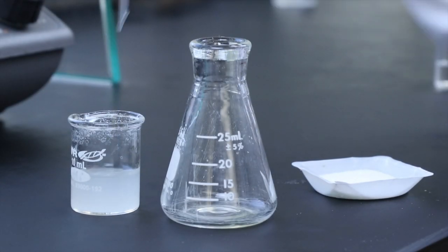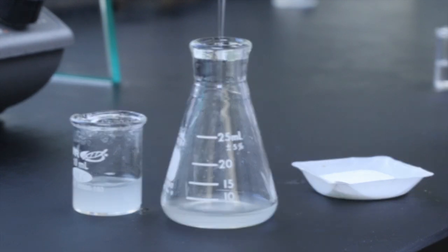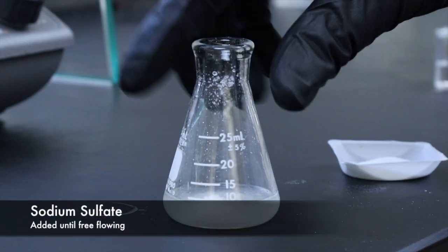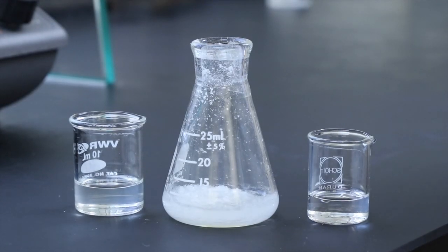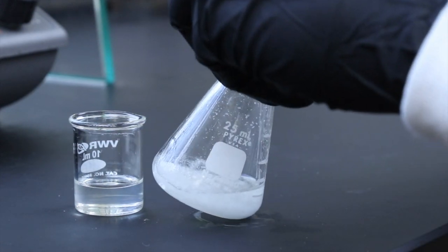Now I can transfer the methylene chloride solution to an Erlenmeyer flask where I can dry it using sodium sulfate, and I'll add that until it's free flowing. Once I've removed the dry methylene chloride solution, I'll actually add a little bit more and rinse the sodium sulfate to reclaim any alcohol product that might have been left behind.